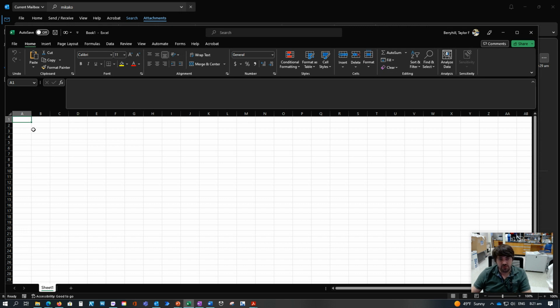But there are two ways you can do this. You can just drag the sample data into Excel and do it manually here, which is a bit time consuming. And the larger your data set is, the more time it's going to take.